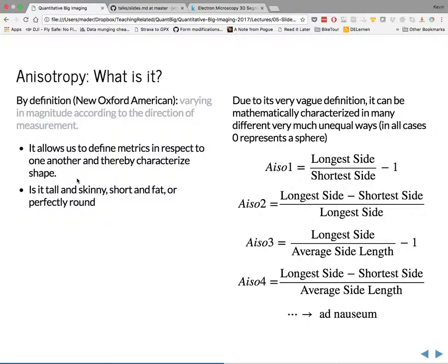If you're looking at a human, people are not completely isotropic, but cells are very isotropic. So you'd actually like to have high resolution in every direction, and it doesn't fit well to have a really anisotropic technique on an isotropic sample. But because of the restrictions of dose and time measurement, you have to apply that.